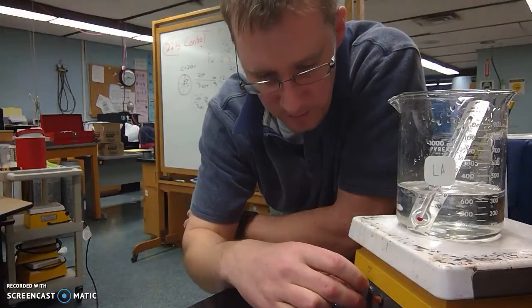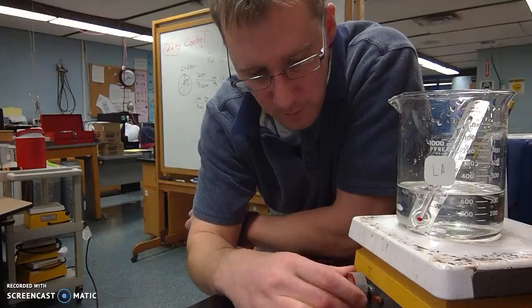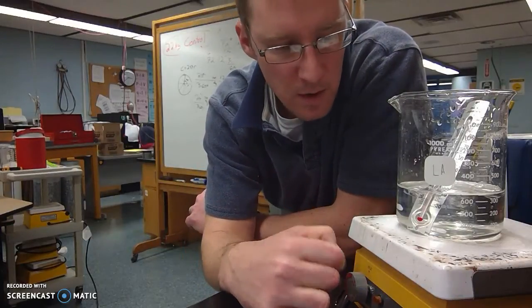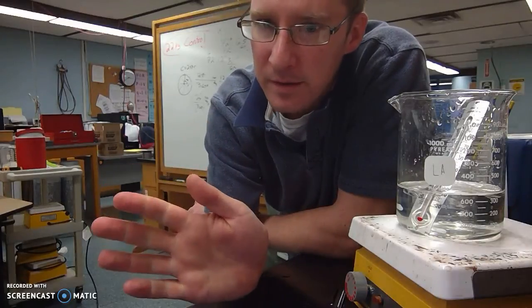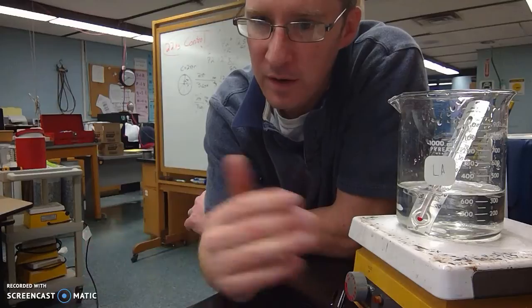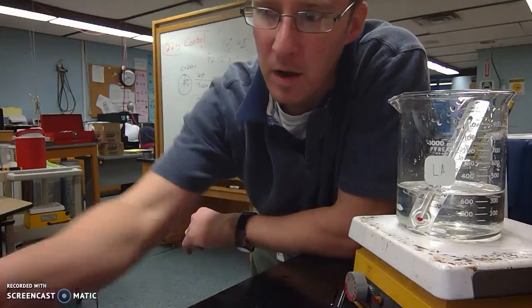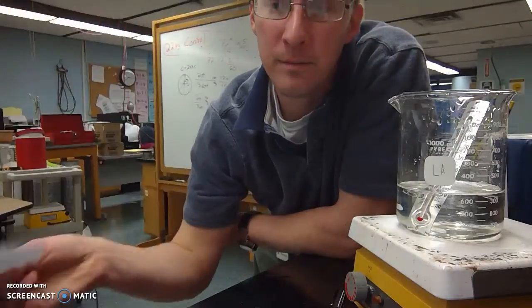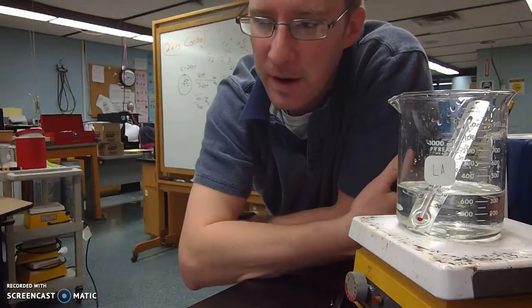You're going to turn on the hot plate, crank it all the way up, and again, recording data every 30 seconds. You will probably have to run this for about 12 minutes. That's how long it took in my lab experiment. Might be a little longer. On the data sheet, and yeah, my data sheet got wet, so you might only want to keep one data sheet in the lab area.